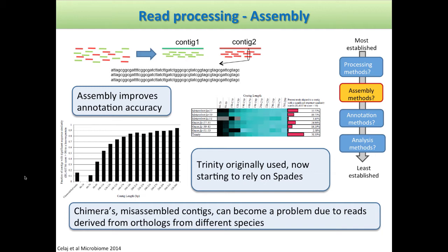One issue that could arise — though we haven't had too many problems with it — is chimeras: misassembled contigs that can be particularly problematic where reads are deriving from homologs from different species. We haven't found this to be too significant a problem in metatranscriptomics; about one to three percent of our contigs might represent some kind of chimera, so it's relatively low. There are tools such as UCHIME that you might be able to apply to identify and correct some of these chimeras.